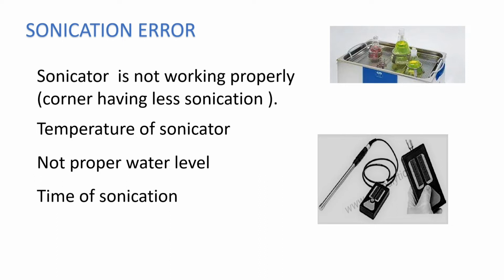In this way, you can very clearly identify how many flasks were completed in what time, and that the sonication was done for the time specified in the STP. So this is the way you can reduce the error for the sonication.